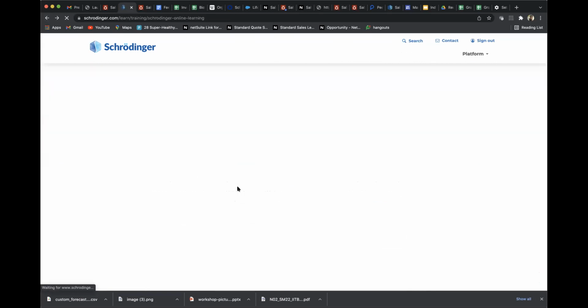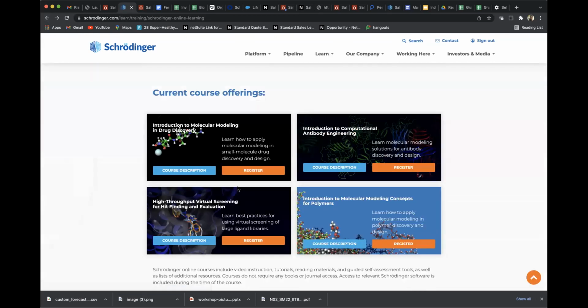The one part that I really like about these courses, so I also took one of these courses, is that I was able to use the Schrodinger without having to have a big machine. And also you can access all the tools that are available. The course doesn't restrict you to try and use any other module that you might be interested in, that might not be in your course syllabus. You can go explore the entire software.